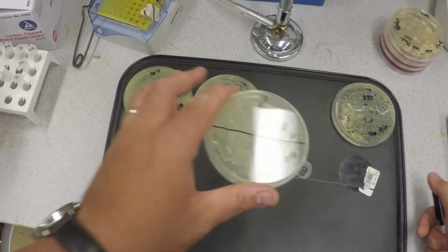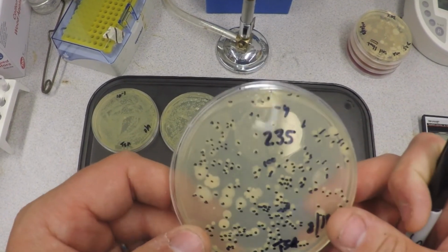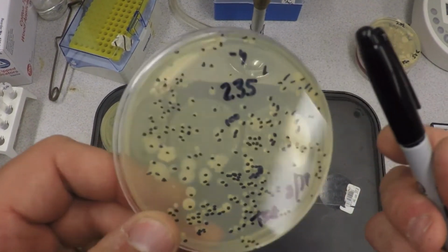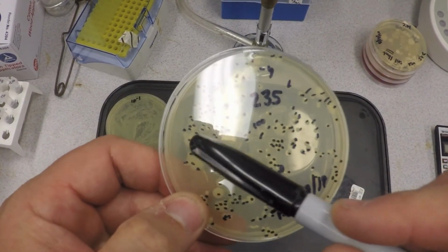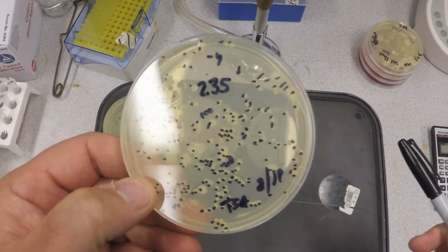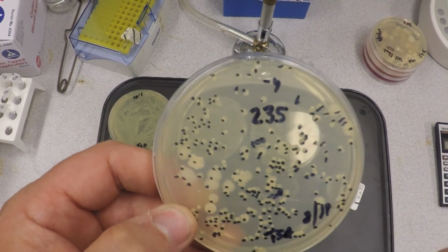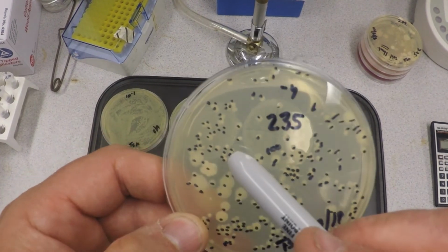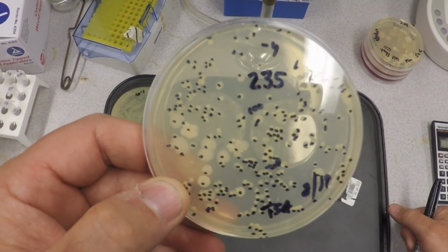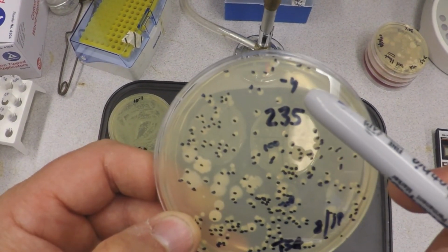Okay, but still. And then we get down to number 1 to 10,000, and you can see what I've done is I've taken a Sharpie and I just held this up and tapped on the back and counted in my little head all these little colonies. And there's different colony types. It was a mixed culture because you got these big puffy ones here and you got these little tiny ones that you can see under the black dots. And I got 235 at a 1 to 10,000 dilution.